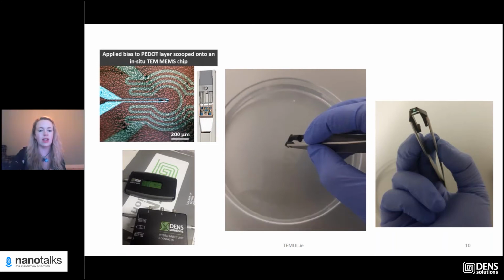Rob and Alonso would float the little polymer flakes on top of water, and then you're able to bring down the chip upside down and then bring it, of course, back upright, and it was able to adhere then to the contacts in the chip itself.